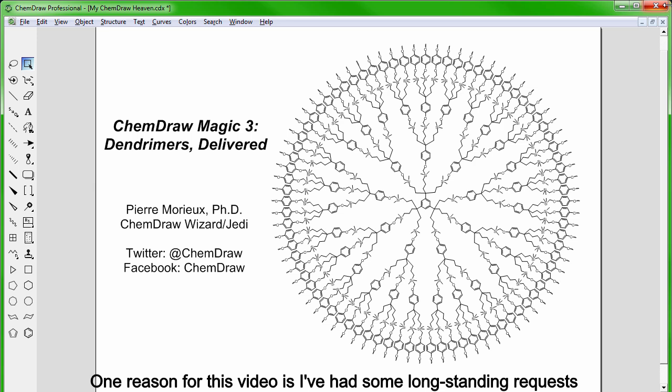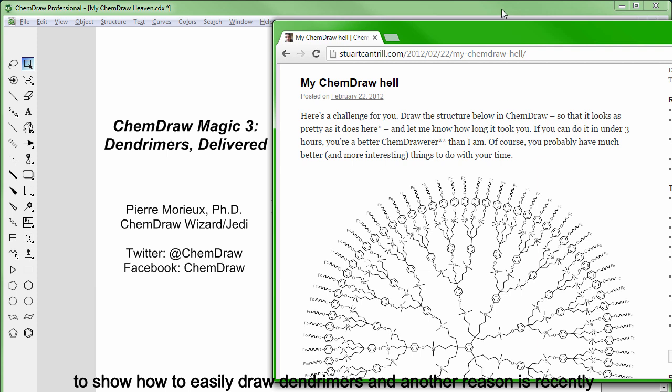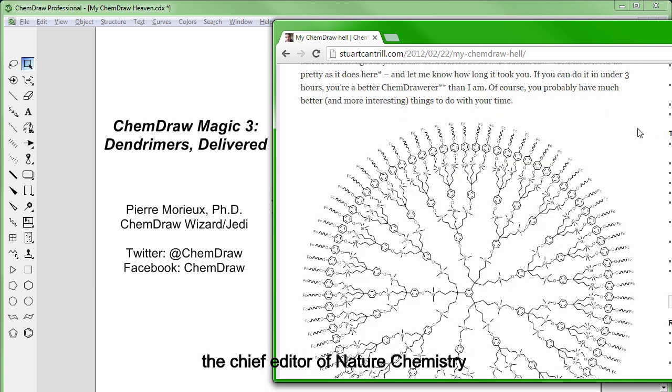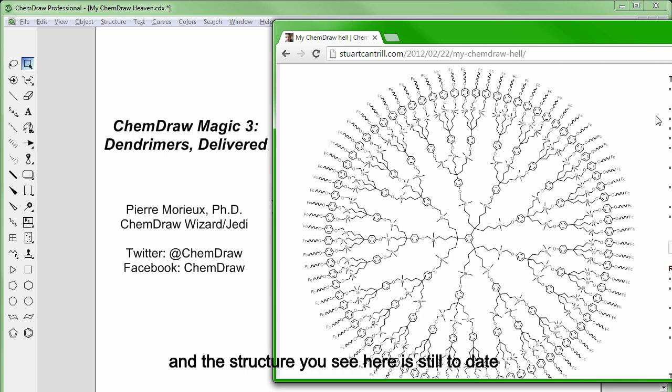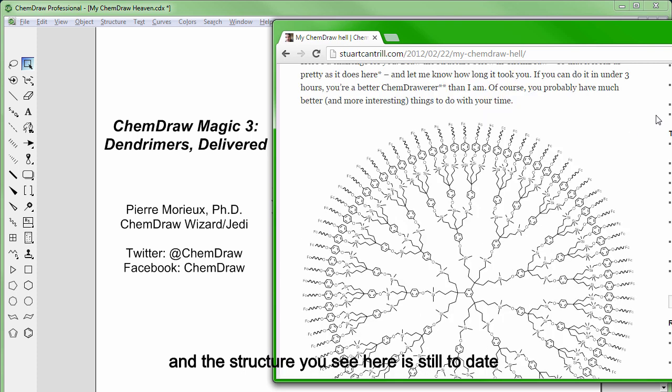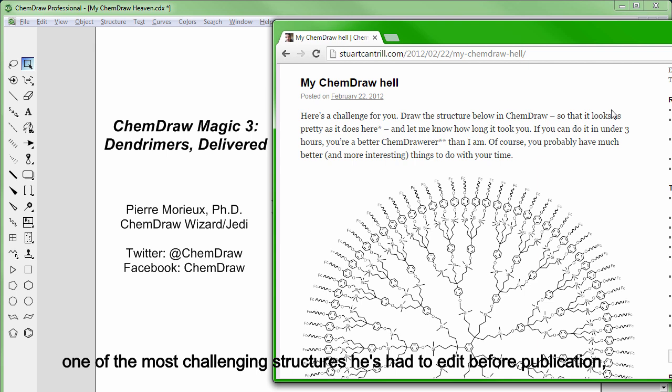One reason for this video is I've had some long-standing requests to show how to easily draw dendrimers, and another reason is, I was browsing recently Stuart Cantrell's blog, who's the chief editor of Nature Chemistry, and the structure you see here is still to date one of the most challenging structures he's had to edit before publication, as you may probably guess from the title of the blog post.